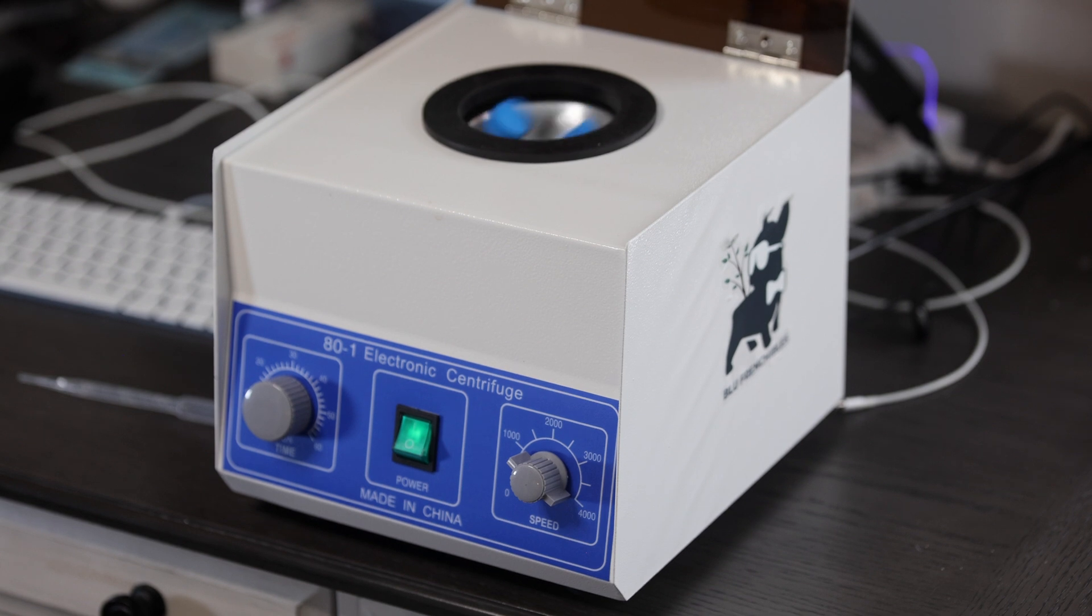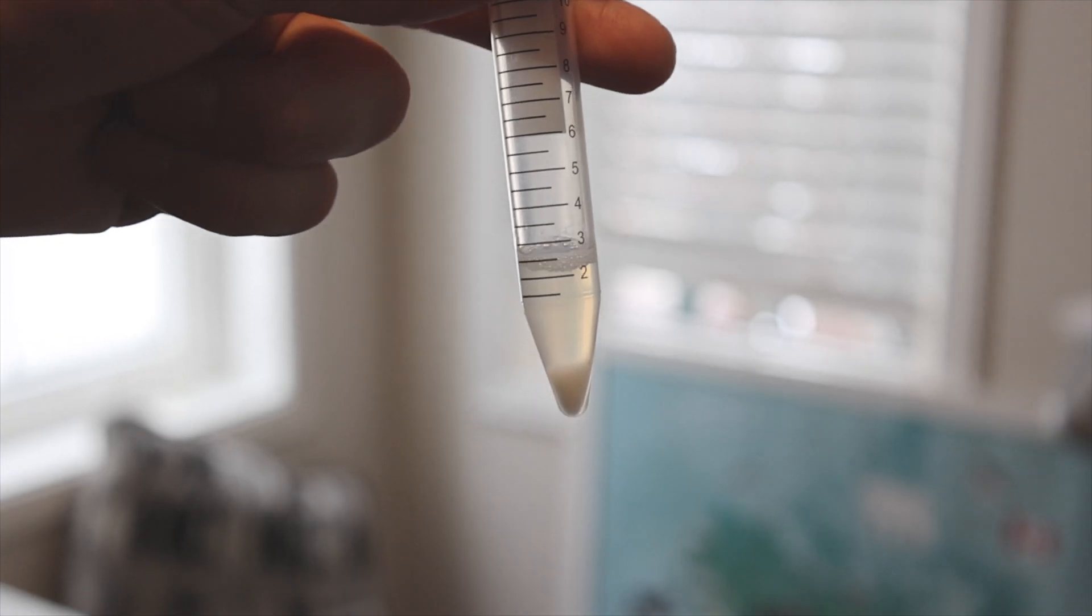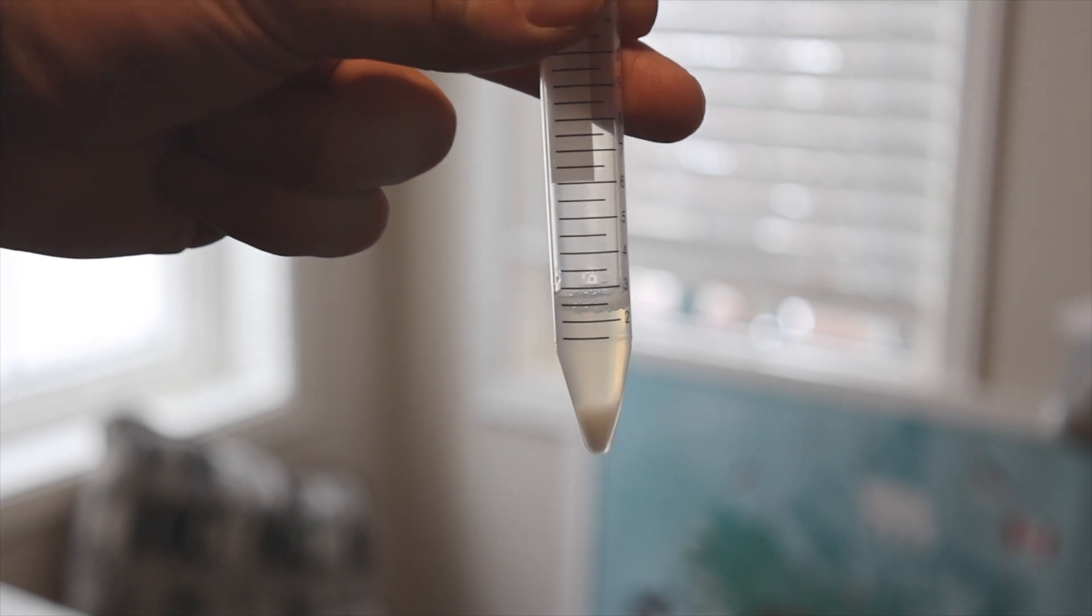The centrifuge is going to separate the seminal fluid and the sperm, moving the seminal fluid to the top and the sperm to the bottom.